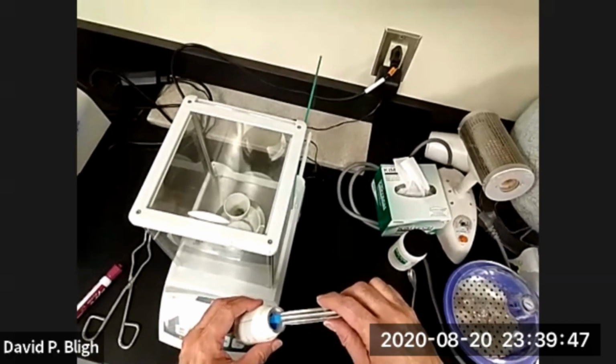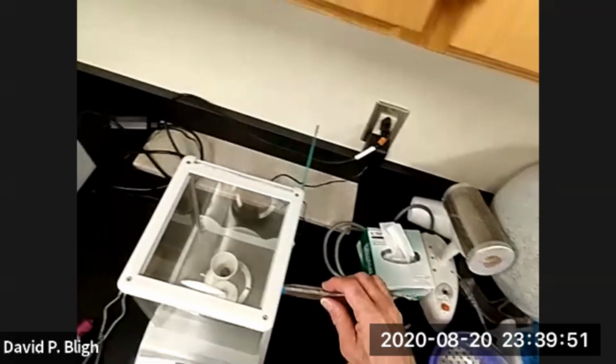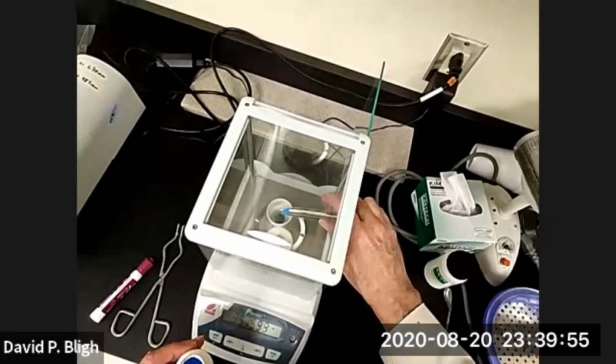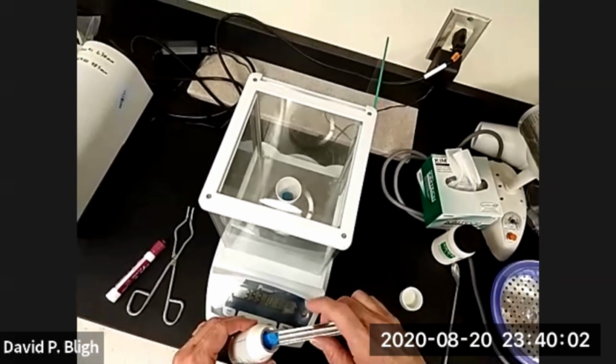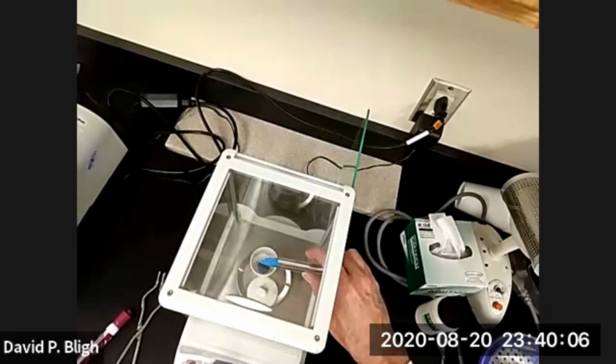Don't put too much because you don't want any falling on the balance. You want it in the crucible. Okay, and you can watch the scale move. That's the nice thing about electronic balances. You can watch the scale move as you add.